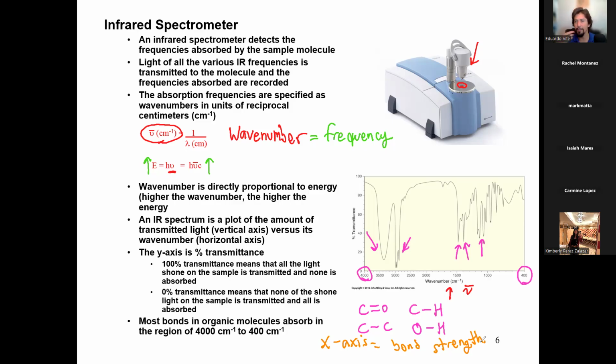Well, before I tell you what that means, we have to talk a little bit about that magical concept that I told you guys about the first semester. It starts with a P, and it's called polarity. Because not only can bonds behave like springs, but bonds are either polar or non-polar, right? We learned this in 111A. Bonds can be polar or non-polar. And so when you're vibrating that bond, you're changing the dipole moment of that bond.